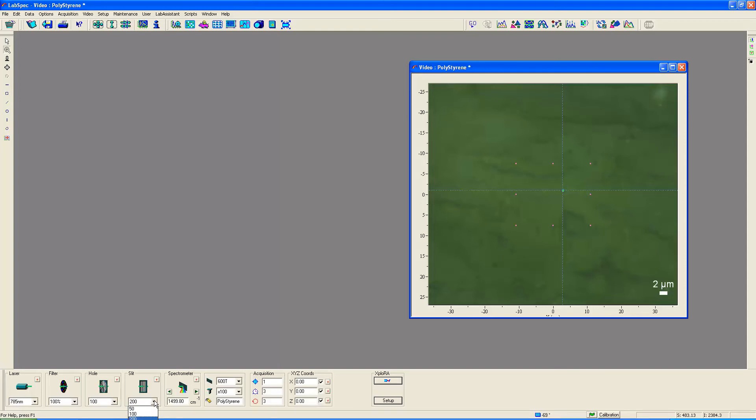A modest slit size, well the largest slit size of 200 micrometers, because we don't really need the spectral resolution as you'll see in just a moment. I have the grating set to 1500 reciprocal centimeters.